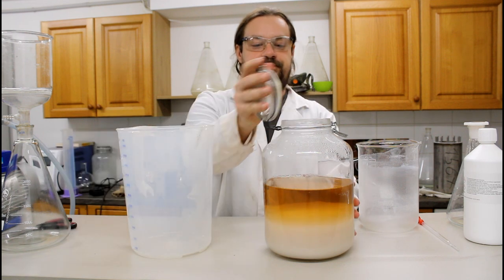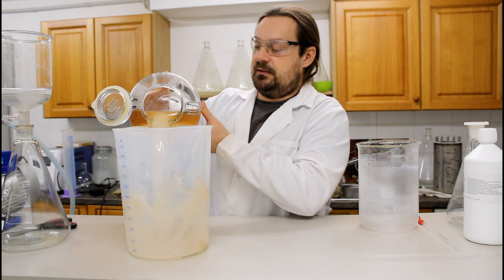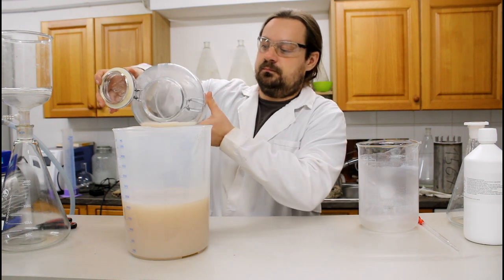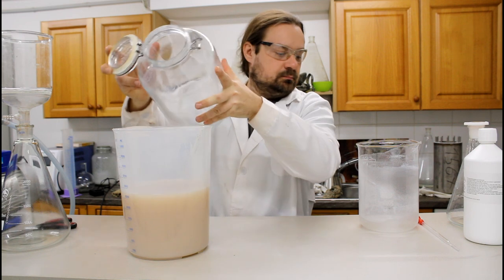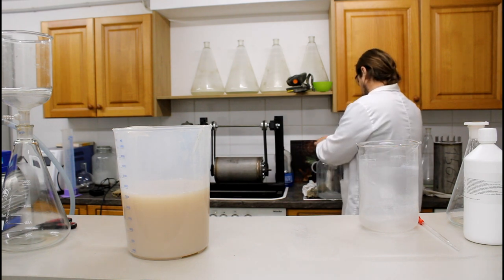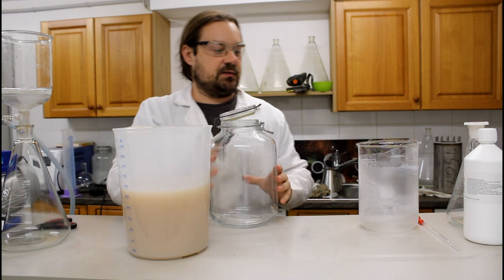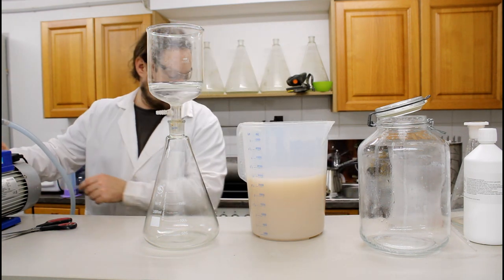Okay, so first of all, I'm going to transfer the slurry in here because it makes it easier. Going to wash this with water. Okay. So now it's time for the vacuum filtration.